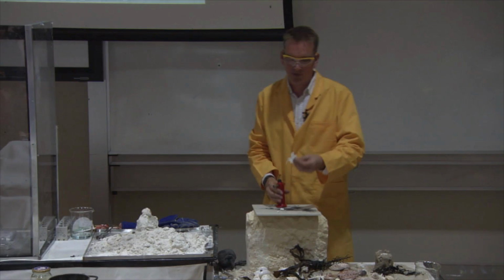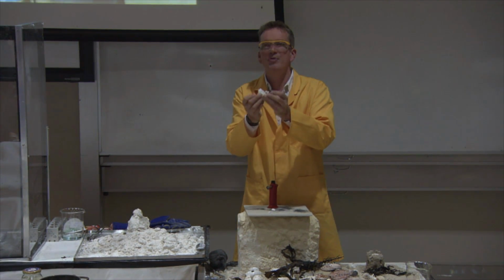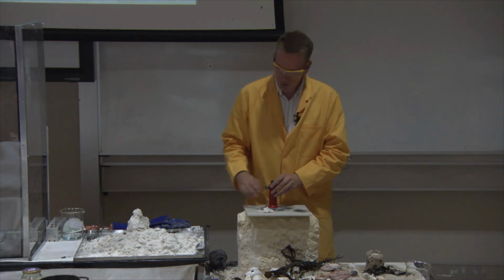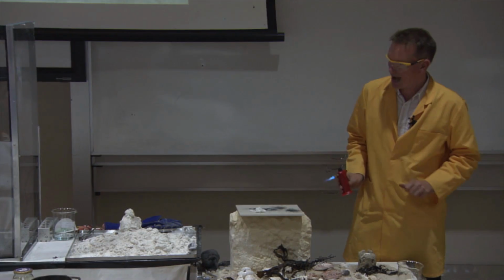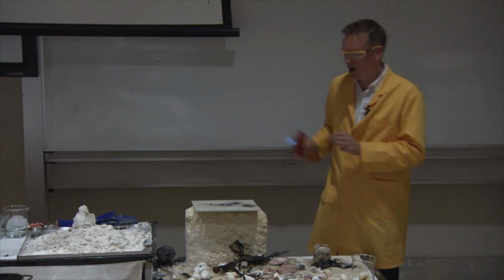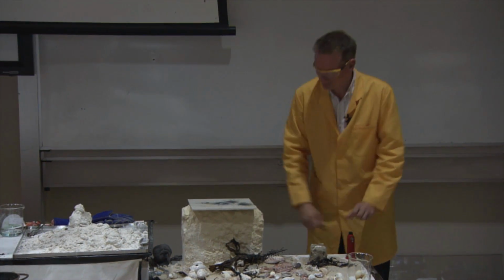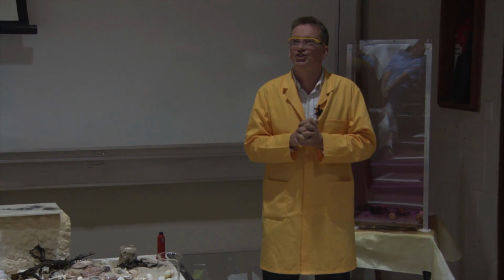Treat this, and we end up with something that looks just like cotton wool, feels just like cotton wool. Nobody would know the difference, but just what happens if I apply a light to this? So watch it, now you see it. Oops, now you still see it. Now you see it. Now it's gone. Okay, now, so that's by locking the nitrogen and the oxygen in.